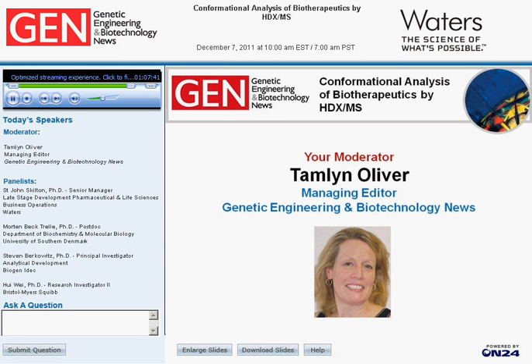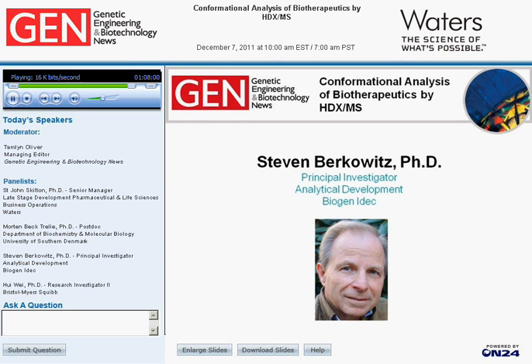Okay, thank you. Steve, I have some questions for you right now. The first one is, could you explain why the difference chart is so useful, especially as it uses the midpoint of the peptide? Yes, there are a lot of comparability studies, as I mentioned, that are very important in the biopharmaceutical industry. That's something that's done quite frequently with a lot of companies, and it can bring a more quantitative assessment of that comparability as opposed to a qualitative assessment, saying two spectra or two different types of thermograms are the same.